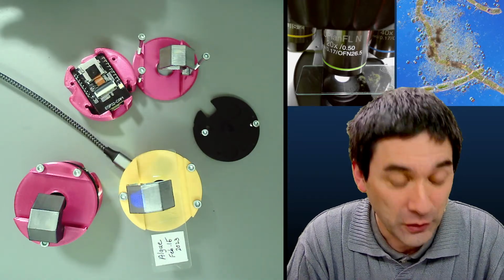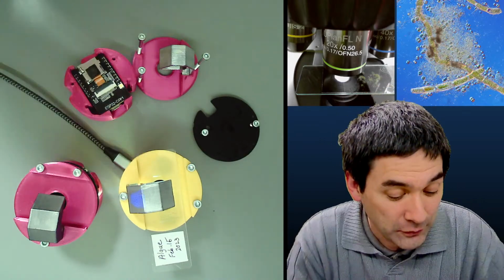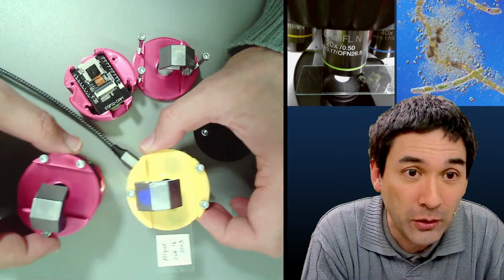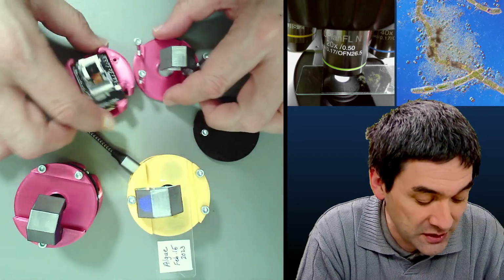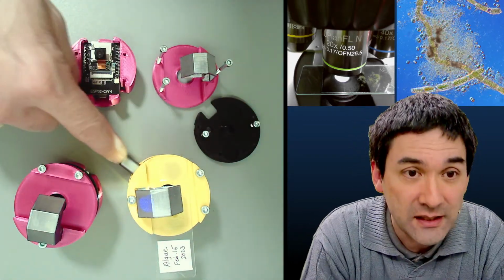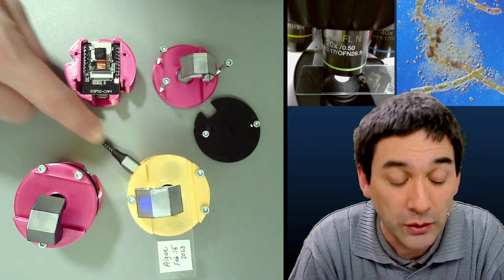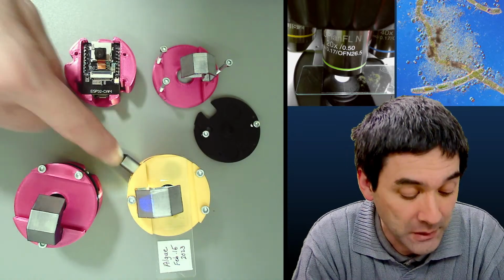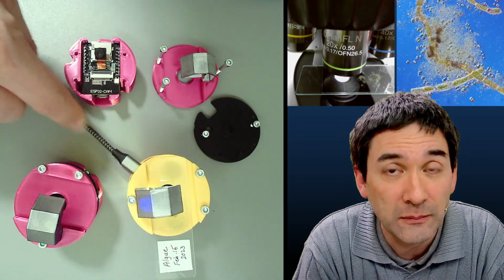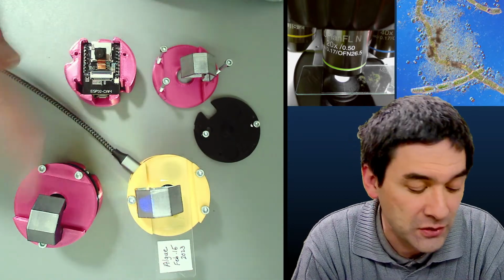Yes, well, first of all, what I've got here is, as a matter of fact, 3 fun little microscopes. Here, 2 of them are already assembled, these 2 here, and this one is taken apart. And here, this is just a power supply. So this is not a USB connector. Well, it is a USB connector, but actually the image is transferred over Wi-Fi to the computer.